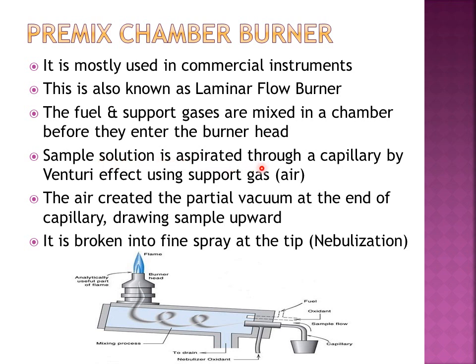The sample solution is aspirated through a capillary by the Venturi effect using support gas. You can see here the sample and the sample capillary. The sample is drawn up through this capillary by the Venturi effect. And what is the Venturi effect? The support gas, which is normally air, creates a partial vacuum at the end of the capillary, due to which the sample is drawn up the capillary.